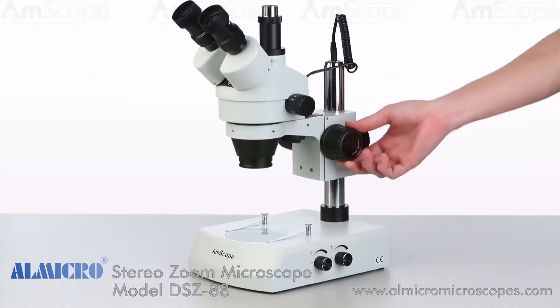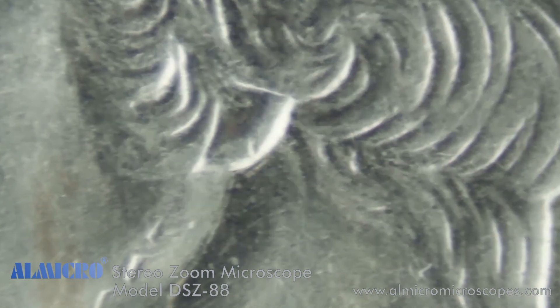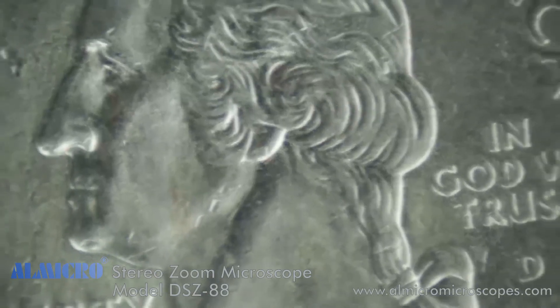To test the focus accuracy, focus on a test subject at low magnification, then move to the highest magnification to fine-tune the focus point. Now move through the zoom range, making minor adjustments to the diopters as needed until focus is relatively consistent.